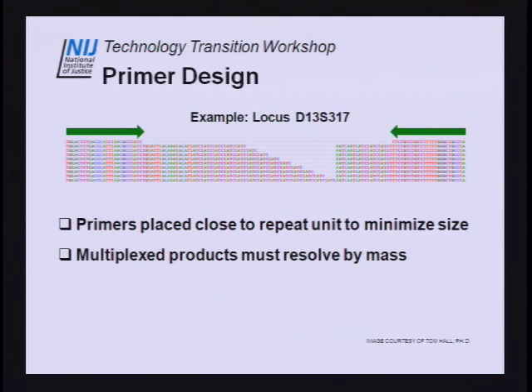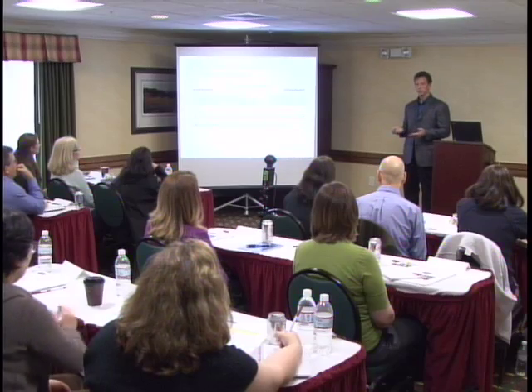Using the technique that we're using with mass spectrometry, it's very straightforward to do STR analyses. You can design primers basically anywhere outside the repeat, and you can use a published repeat structure and develop a database of known base compositions for what you expect. What this means is we don't need an allelic ladder.